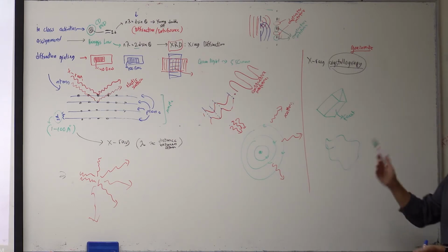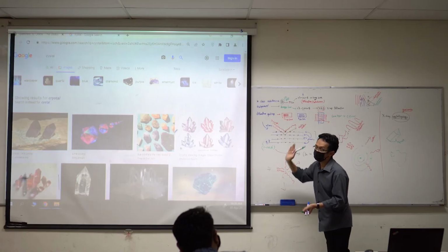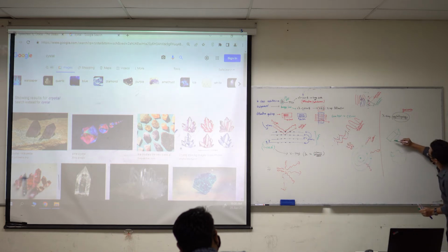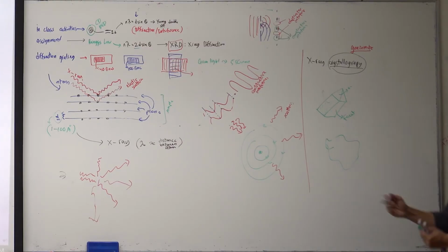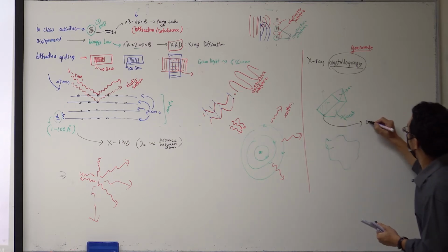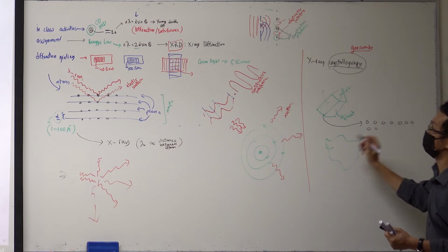But when people found that the crystal has a very specific arrangement, such that this facet is very smooth, and this facet is very smooth, and so on, the reason it is so smooth is that if you dig deeper and look at the atoms there, they are arranged regularly, an atomic array like that.